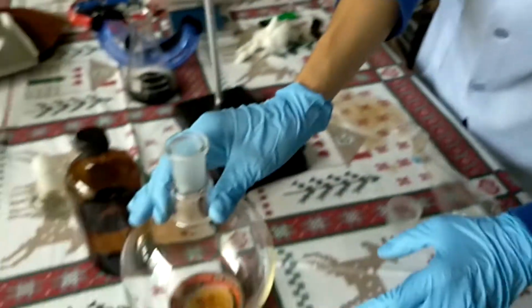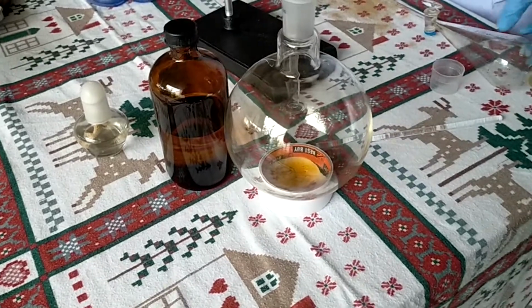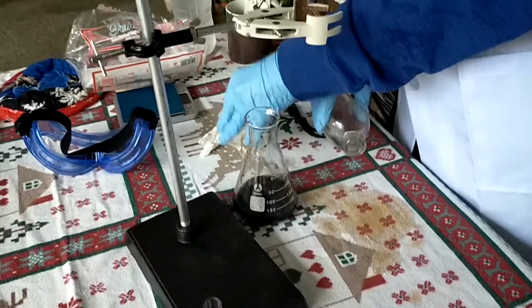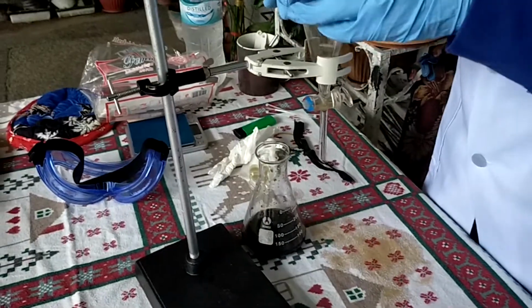Okay, just put it here and introduce this aqueous layer onto the separatory funnel. Close this, close.